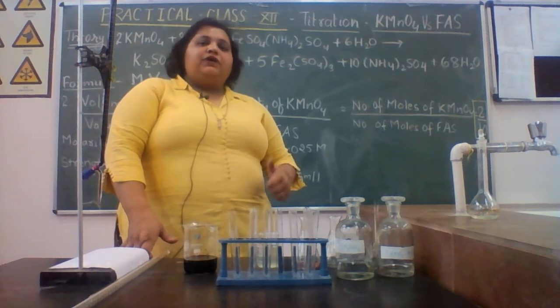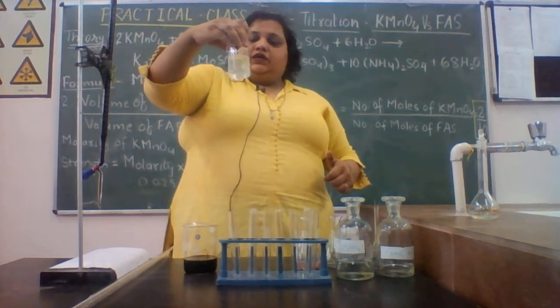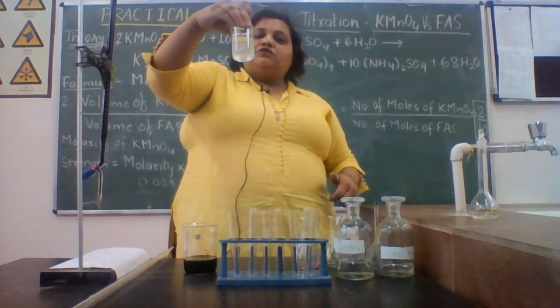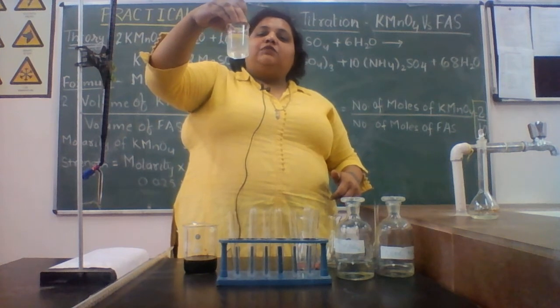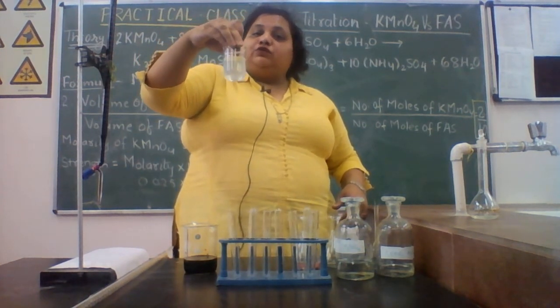So, let us begin. This is the solution that I have prepared yesterday, the same I am going to use. You can see it is very clear and transparent, that means it is a perfect solution. Otherwise, it should have turned into brown.